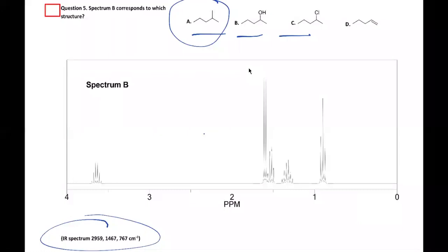You saying which one we think is like by 3.5? No. Which compound? Because we can rule one of them out. We already did the spectrum for D, so we don't worry about that. We can rule out A because there's no way you should have a shift all the way down at 3.5. Based on A, there's nothing in there that's going to cause that kind of deshielding. So it's going to be between B and C.